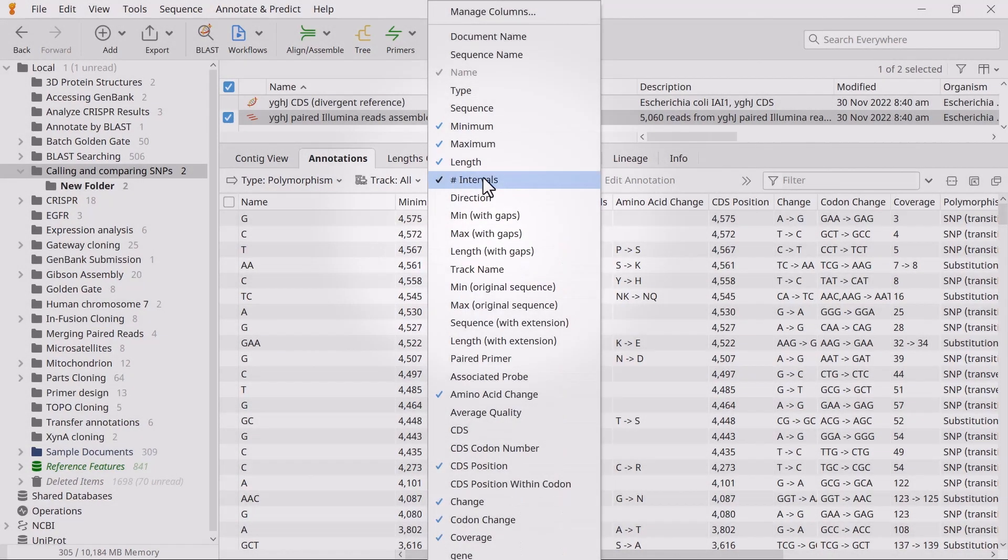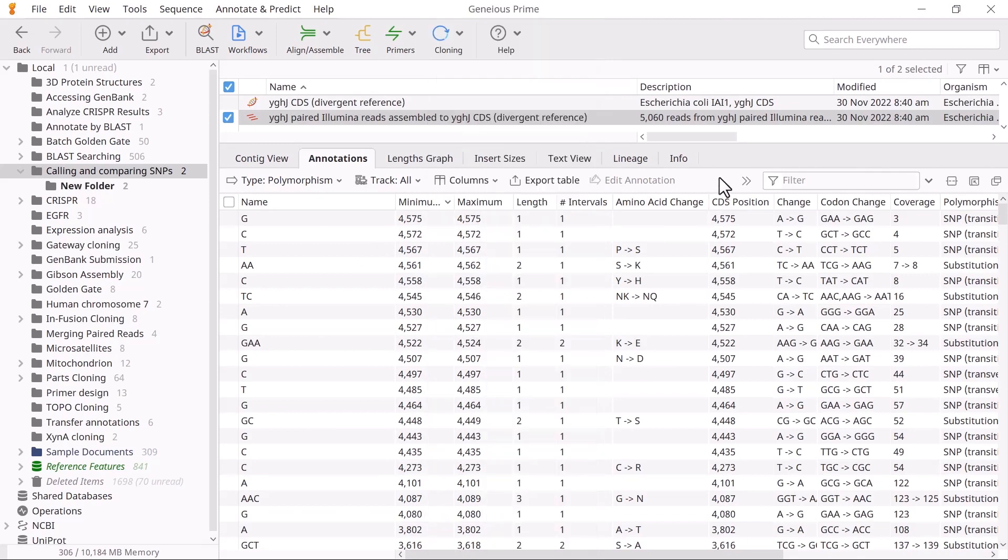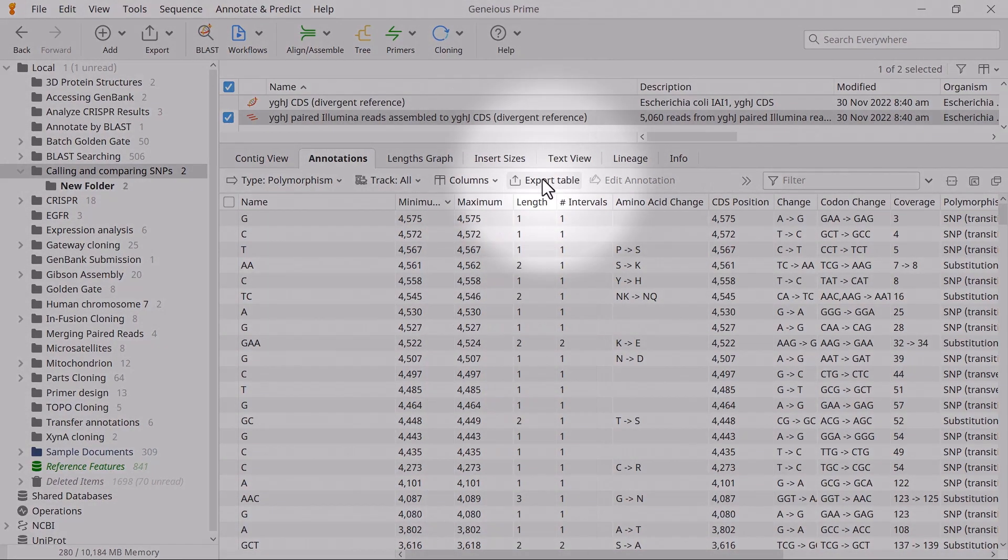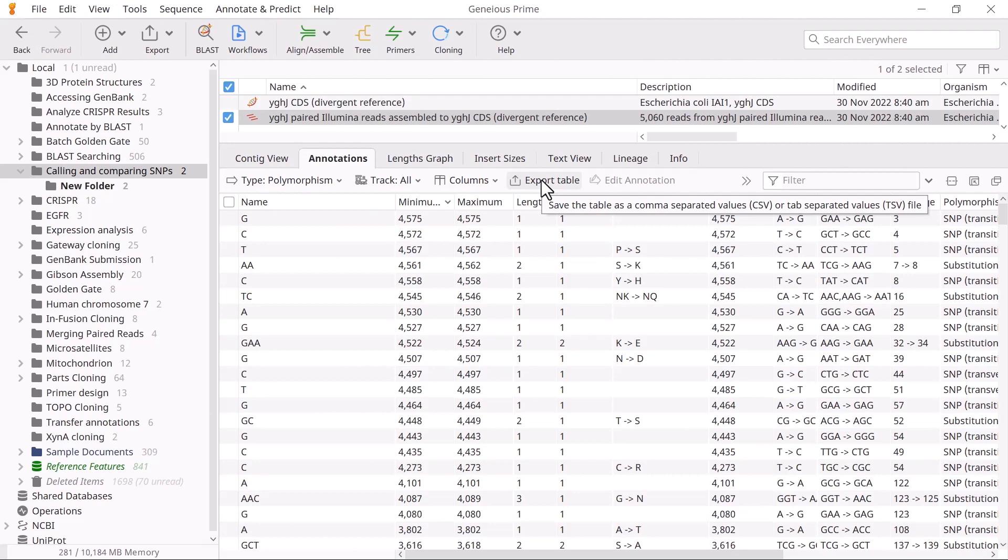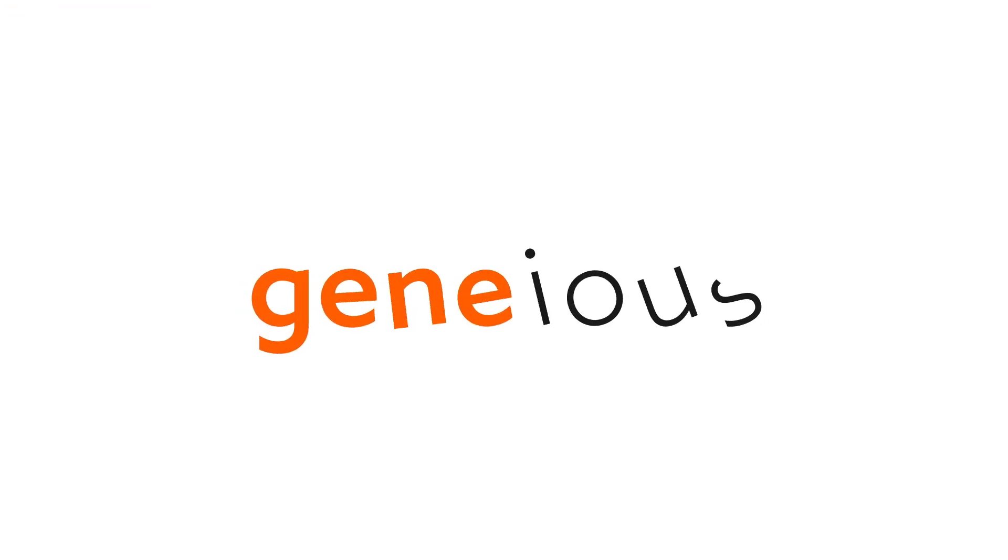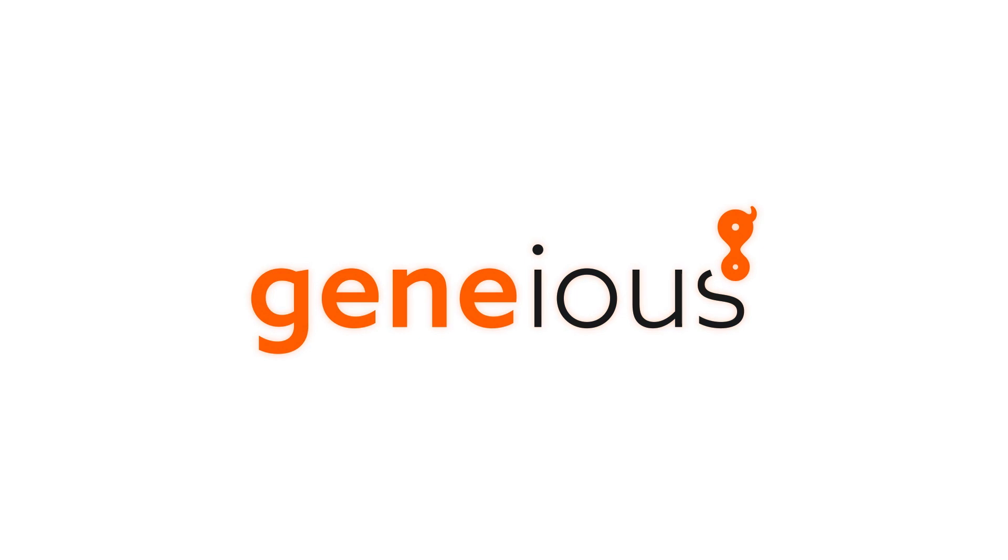Finally, you can export the table as a CSV file by selecting Export Table. That's an overview of how to call SNPs in Genius Prime. To learn more, visit Genius.com.